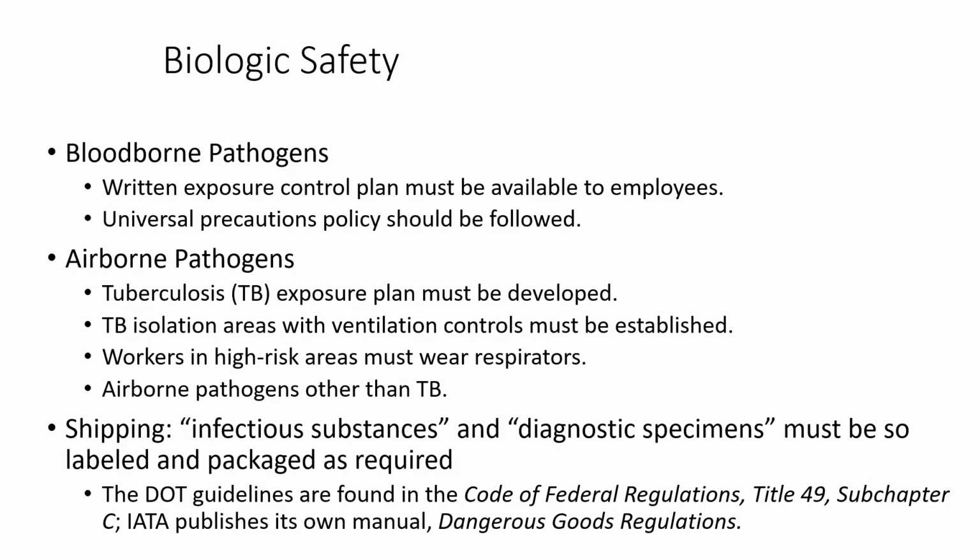And airborne pathogens other than TB, including some types of fungal spores, should be worked with in an appropriate biosafety cabinet and area. Typically with Mycobacterium, there is a separate room. It's classified at a little bit higher of a level, so BSL-3 instead of a typical BSL-2, and you have to be completely protected, usually wearing a bodysuit and some type of advanced respirator before you go into that room to start doing manipulations of Mycobacterium.